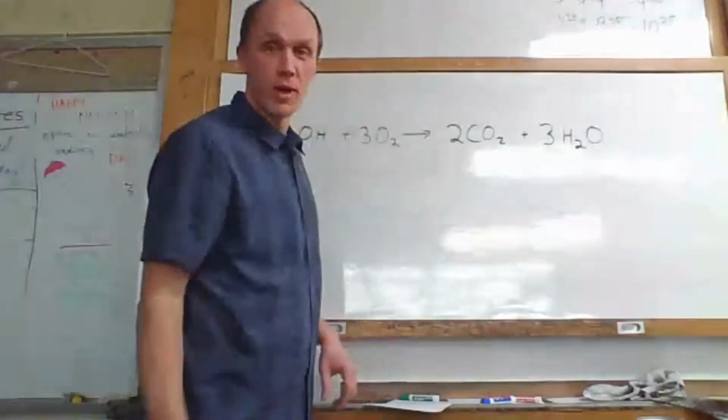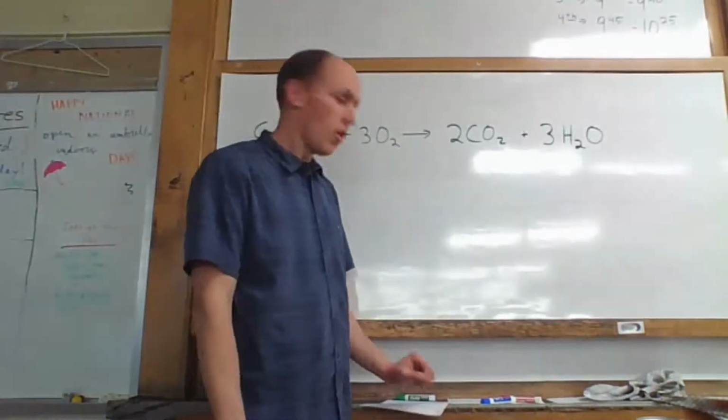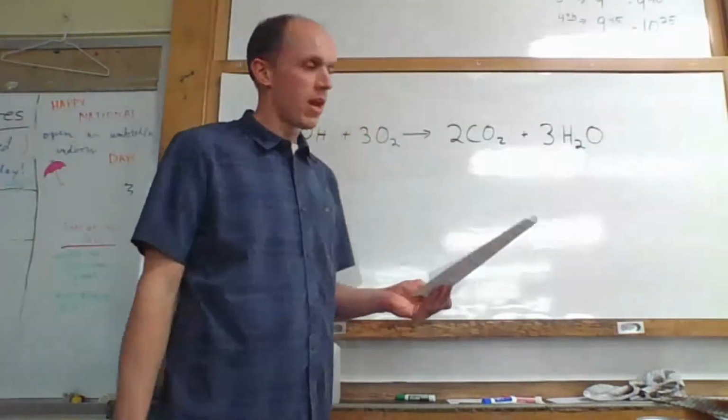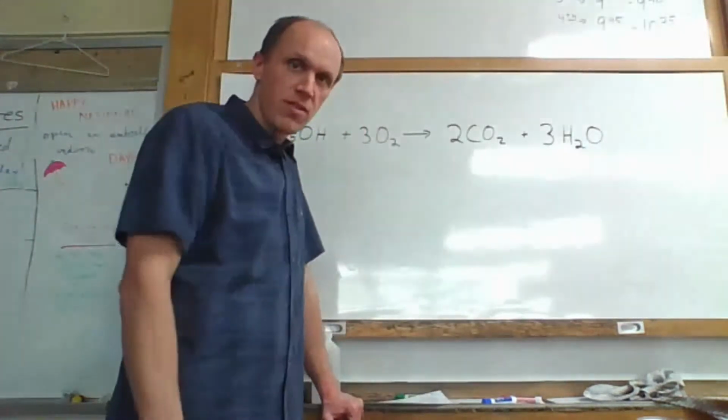All right, welcome everybody. We're going to go ahead and walk through the lab we did today for our virtual students. So we are working right now on a lab called Enthalpy of Combustion lab. So the way this works is there are two parts to this little guy.